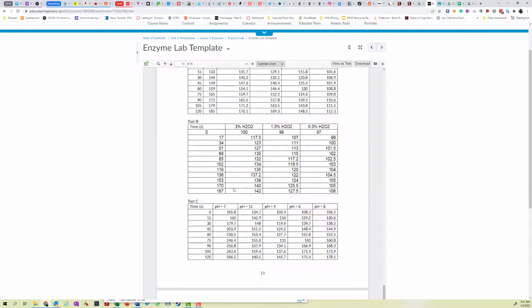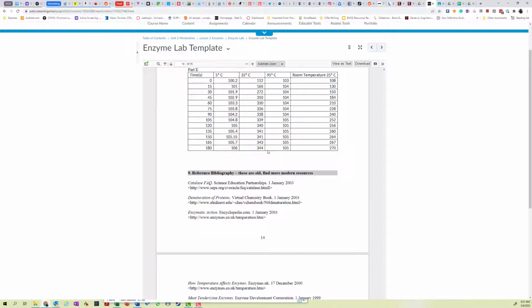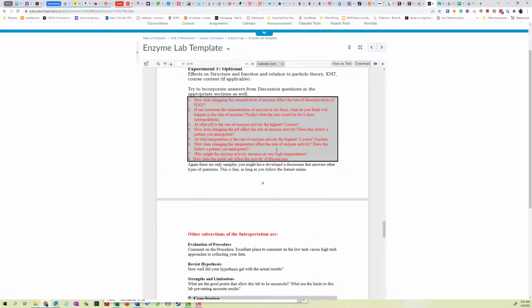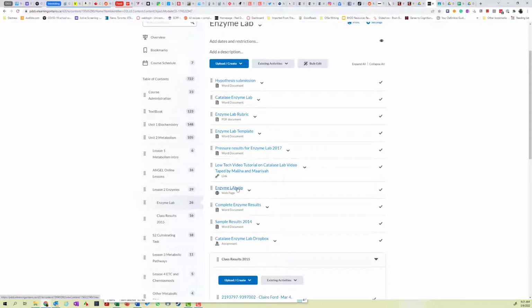And then there's several forms of that data. So this data is something you can compare it against, but it's not the high-tech data that you used. If you want to use the high-tech data, then you're going to have to go into some of these other zip files or other sample places. But generally the best data to use is our class data.